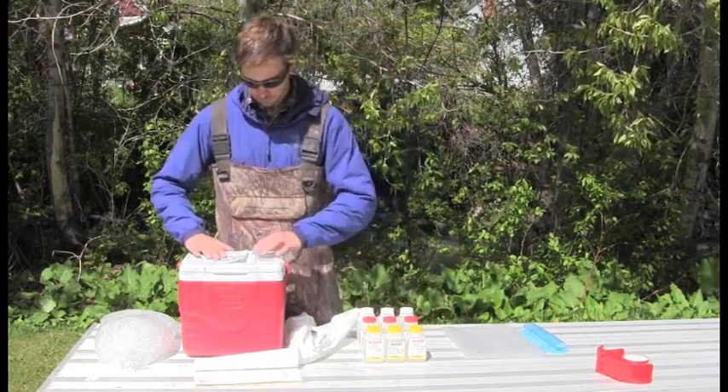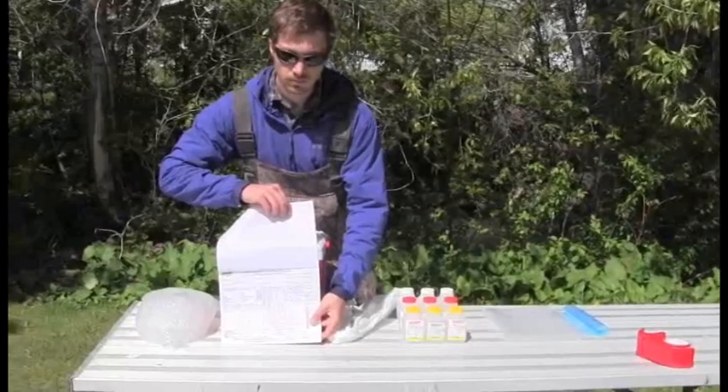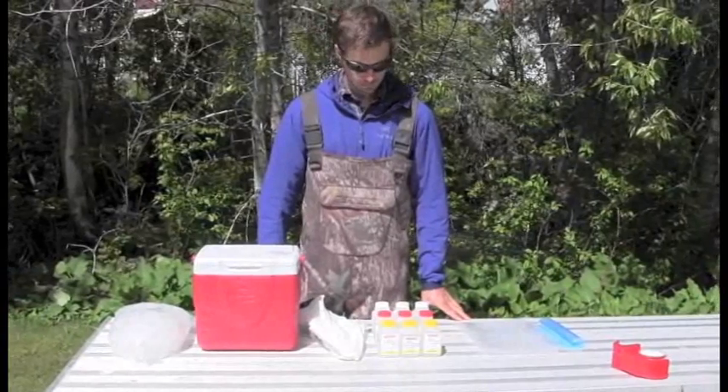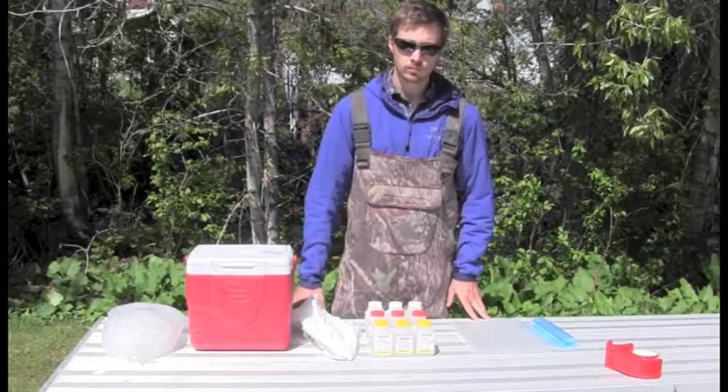Before shipping the samples, make sure you have the necessary items: shipping labels, a chain of custody form, ice for shipping, a garbage bag, enough Ziploc bags to hold the samples and the ice, and packing tape.